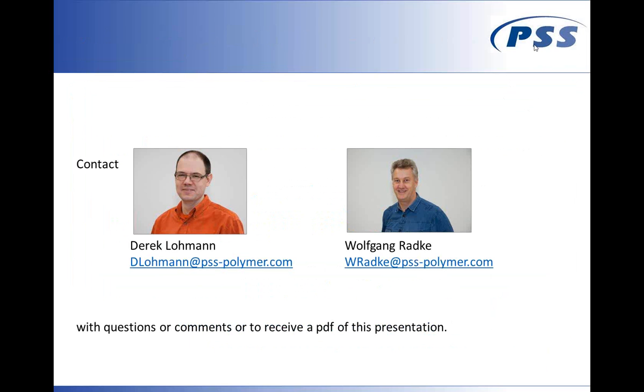As we have seen before, we had this very nice separation in a gradient, where we have much better separation by gradient chromatography. So in principle, I'm not a fan of isocratic adsorption chromatography, because if you would like to elute higher molar masses in a reasonable time, your adsorption strength of the repeating units is so weak that the tiniest change in eluent composition creates problems.